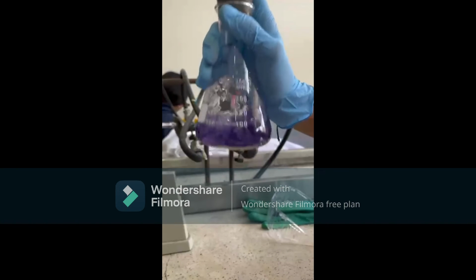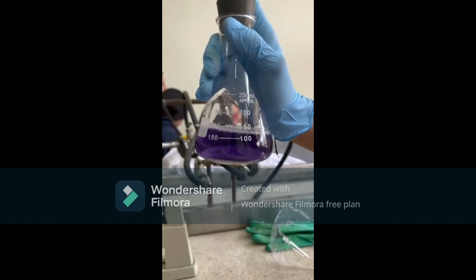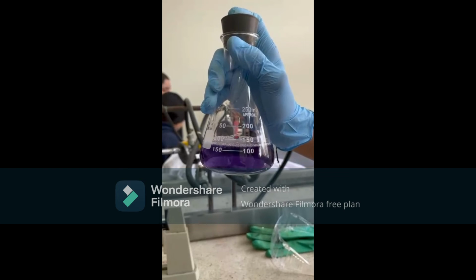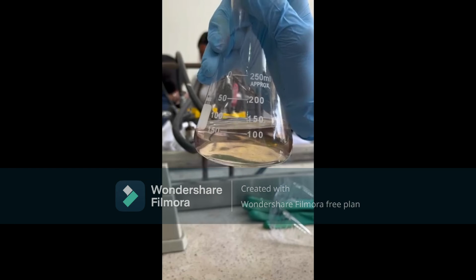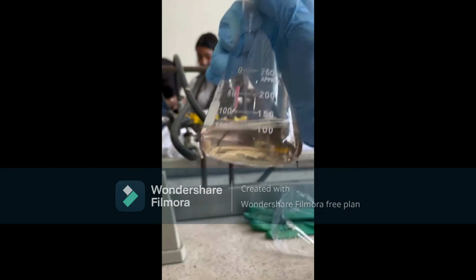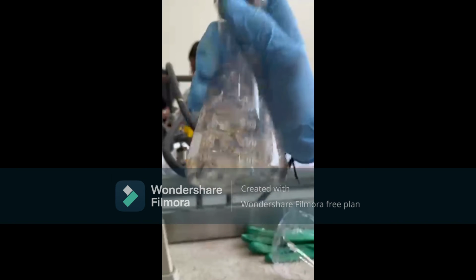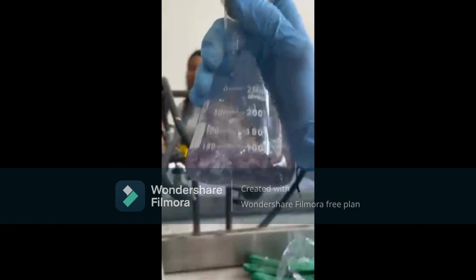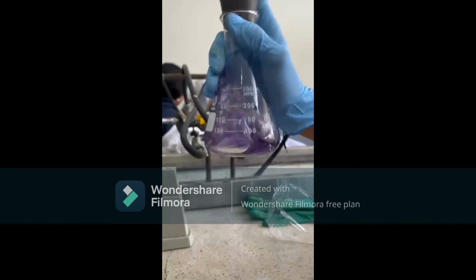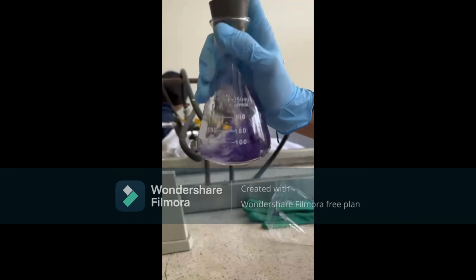For this, we have three thoughts. The first one is that maybe since the bottle was hydrolyzed during the method by adding heat with a heat system, the substance was getting cooler, so that means the glycosidic bond that was broken joins again, and the glucose became again a saccharose, making the join by means of the glycosidic bond of the glucose and the fructose.